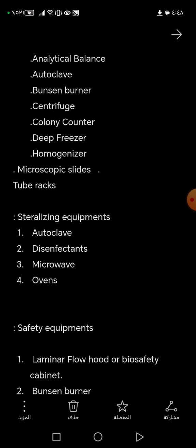You can go to other videos actually, but I will explain about techniques of culturing, streaking, and of course I will explain about interpretation of the results of culture results.